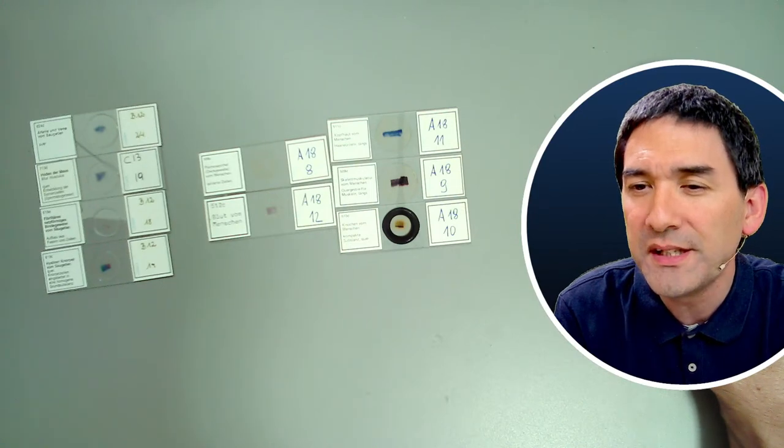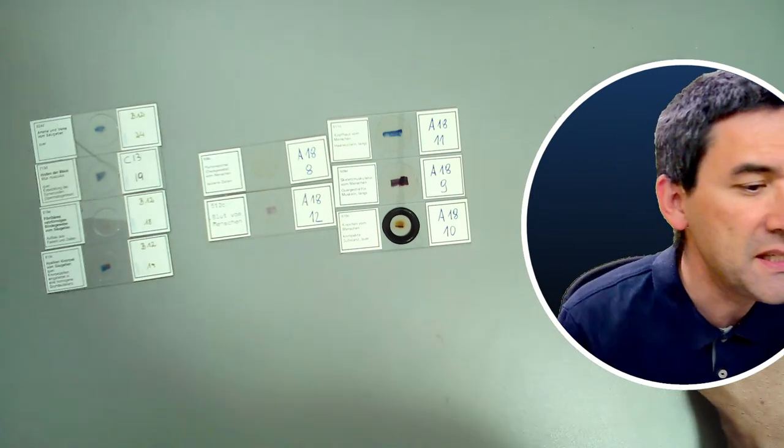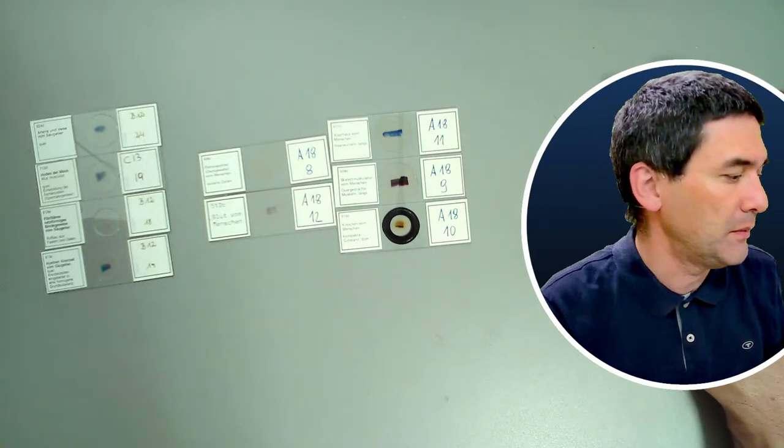Somebody has asked about pathological slides as well. They might be from diseased patients. Yes, this is possible, but usually people have to give their consent. And the fungus specimen, I think I must have somewhere over there. I can also look at this as well.